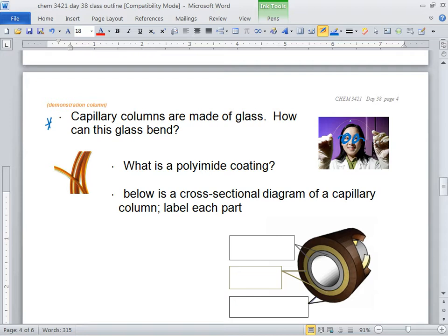Glass shouldn't be bending. But also, glass shouldn't be what color, Ida? Ida, what color is this stuff? Copperish. Well, what color should glass be? All the glass that we know of should be clear. So something already is funky going on here.